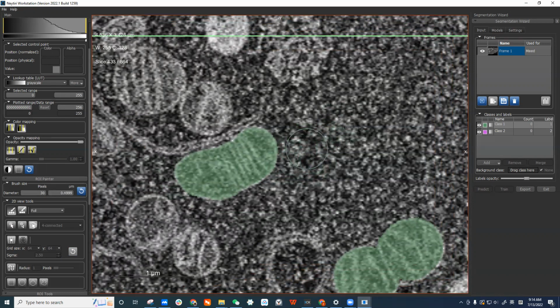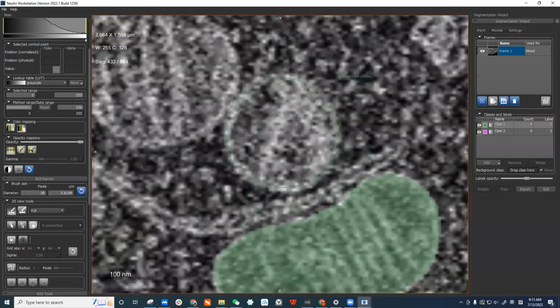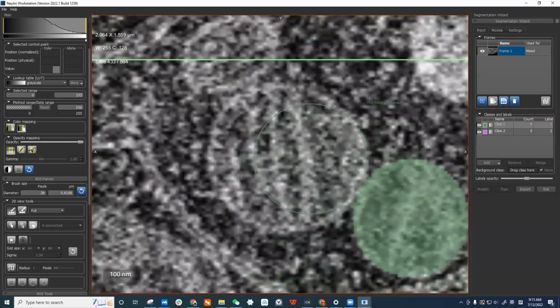But if my mouse cursor is in the center part of my screen, I can increase or decrease my size by pressing the control key and using my wheel. But if my cursor is near the edge of this view, I'm not able to do anything. My brush cannot be resized, which is very weird. I reported it. I hope it will be fixed in the next version.